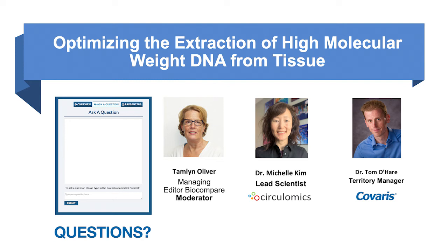All right, here's one more question, and then I have a slew of them from Michelle. So, Mary, here's one for you. What about using bead beating for homogenization? How does that impact the integrity and read length? That's probably a question more so for Michelle, since we don't have or support a bead beater at Covaris. Michelle, would you like to comment on that one?